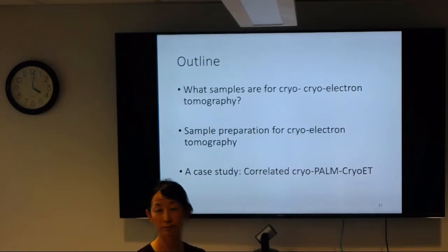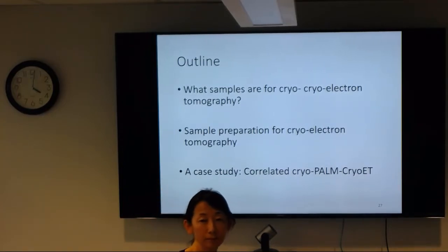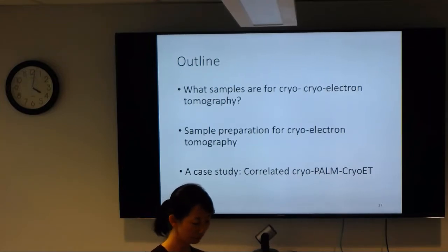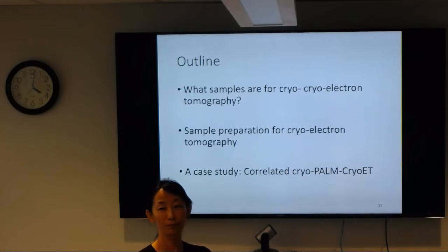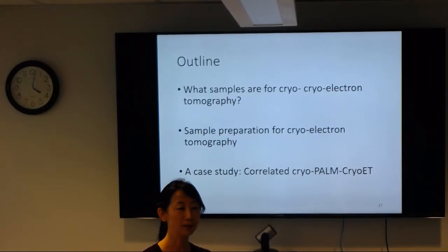Usually people in the literature have grown those cells on other things, so I just start with whatever people have done in cell biology or optical microscopy papers. But at least double the concentration. When you coat the bottom of a flask, or you coat an EM grid surface, they are very different. The cells really don't grow that healthy on that.